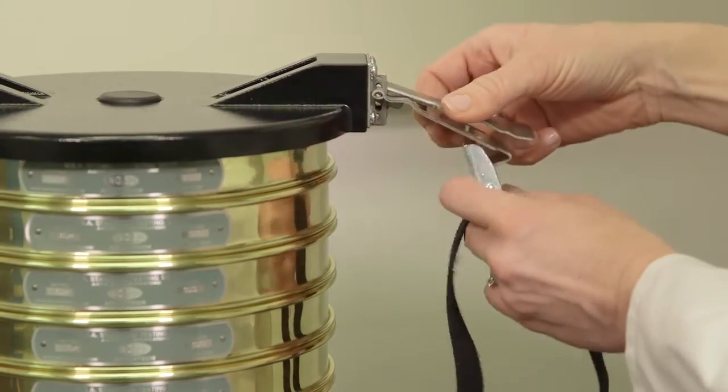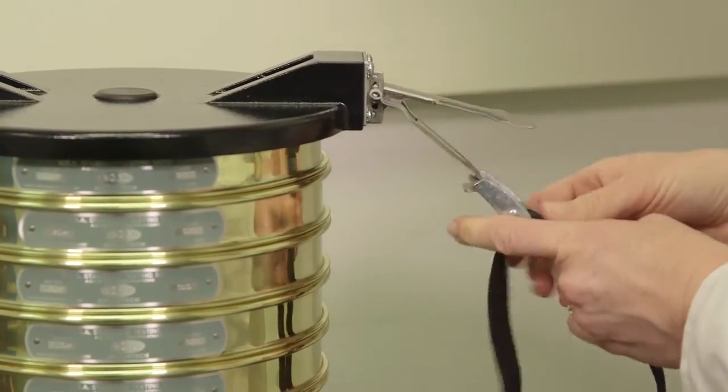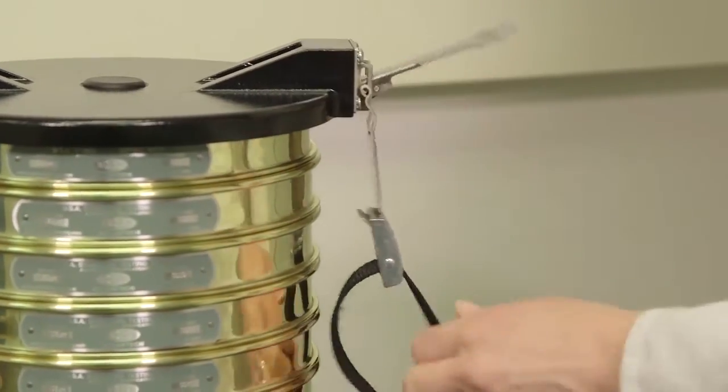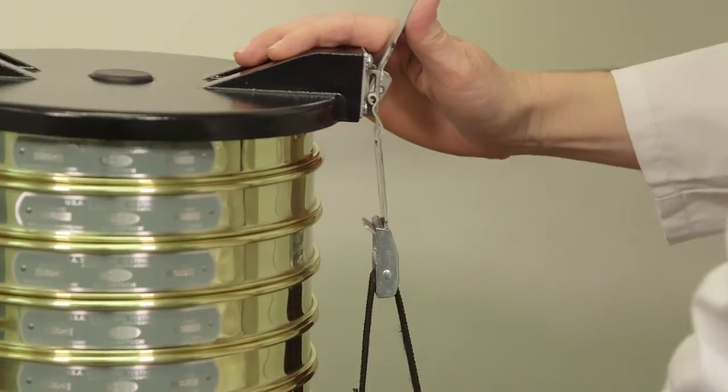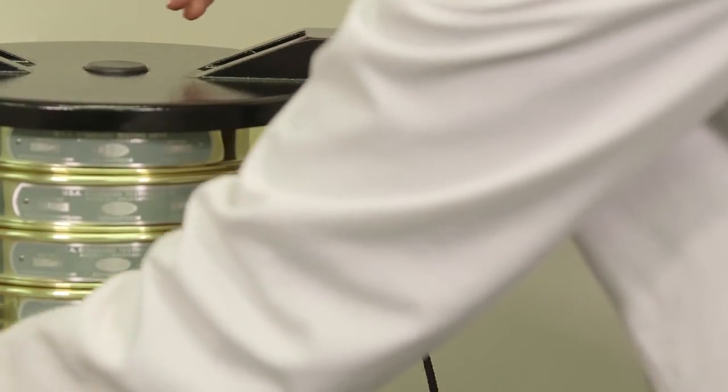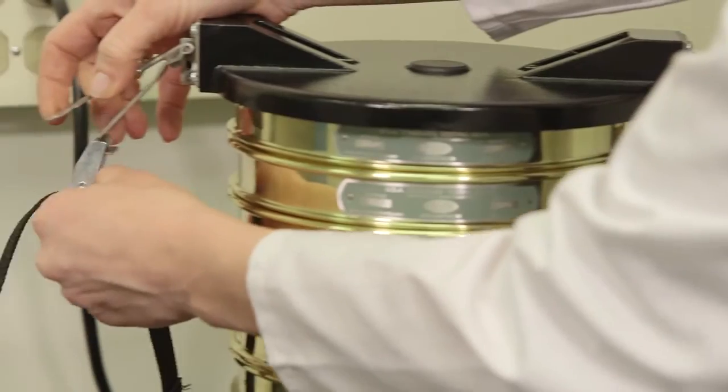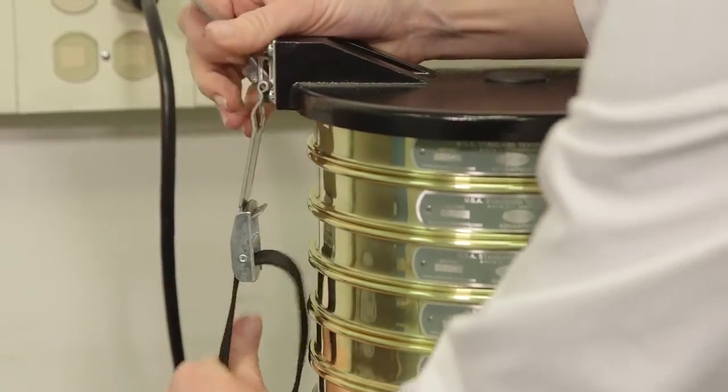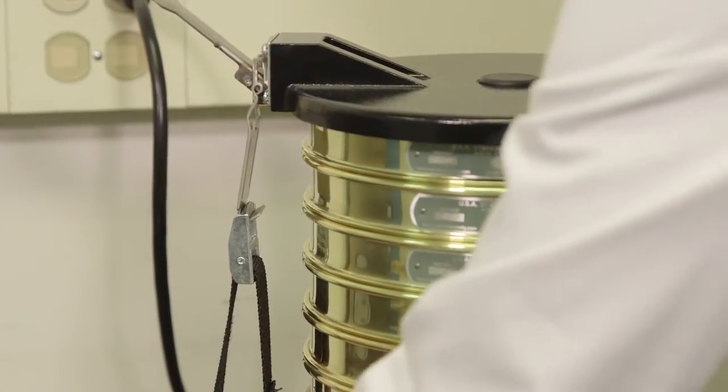Raise the clamping latch lever upwards to expose the latch hook. Hook on the clamping strap and pull to tension. Do not over tension. The clamping latch lever will remain in the raised position. Repeat this process on the other side.